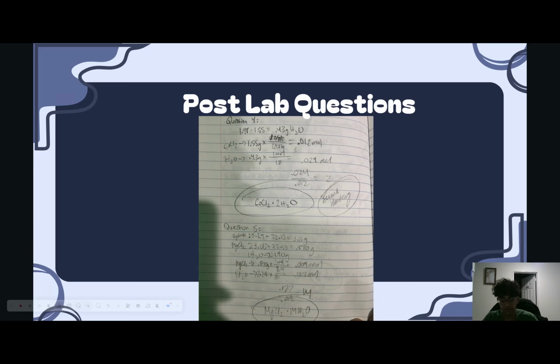So the final chemical formula was MgCl2 times 14H2O. Thank you, and that's our lab report.